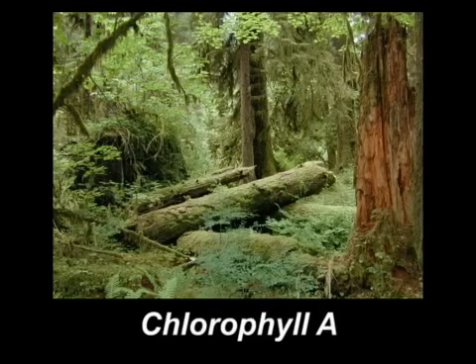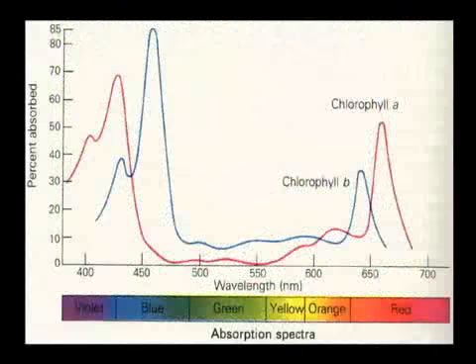Chlorophyll A is found in all photosynthetic organisms. This pigment may be the most familiar to you, as it imparts the dark green color in most of the leaves you see. Chlorophyll A, as you have learned, has two specific absorption maxima, or light wavelengths, that are preferentially absorbed. These wavelengths are in the blue-violet region and the red region. The chlorophyll A pigment does not absorb and therefore reflects light in the green wavelengths, which is why many plants look green to the eye.